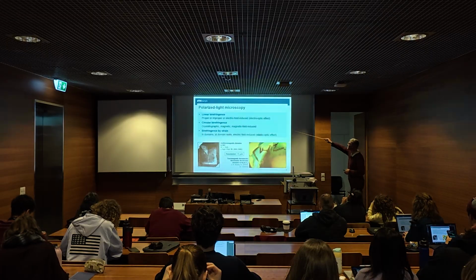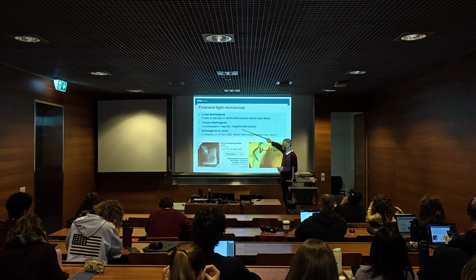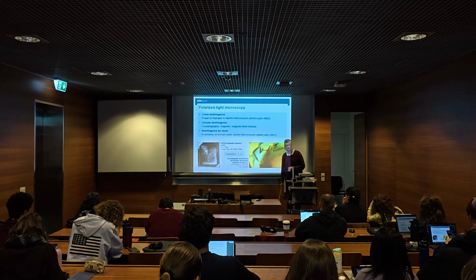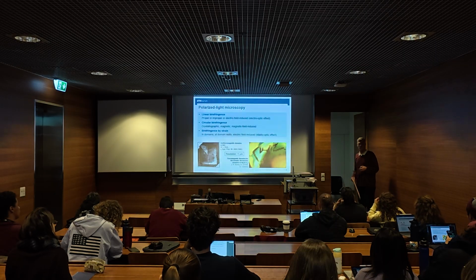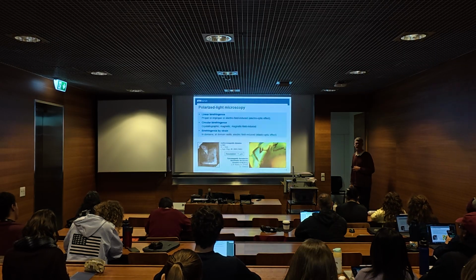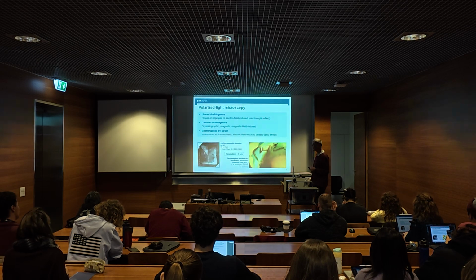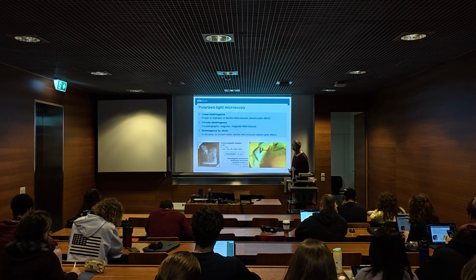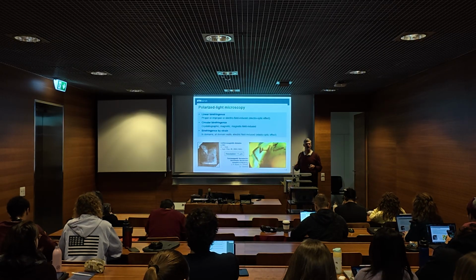So that's linear birefringence typically, or you can also work with circular birefringence, strain-induced birefringence. So basically, optics means that you change the polarization of your light and you detect this with a polarization microscope. So the resolution then naturally is 1 micrometer because that's the wavelength of light. And it's non-invasive, cheap, whatever else. The optics is really convenient.